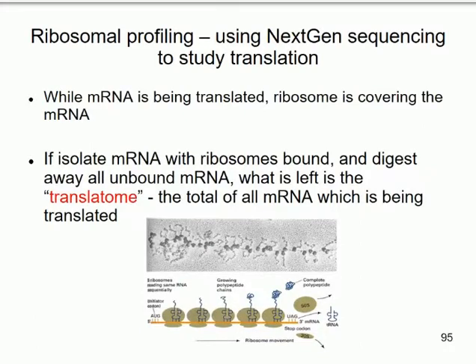And they call this the translatome. So this is the sum total of all the messages which are being translated. And this is rather like PCR. This is one of those techniques that when I first heard it described to me, in the first 30 seconds, I thought, why didn't I think of this? It's so obvious, and it's such a nice method. And although technically quite challenging to do, it's very straightforward in another way.